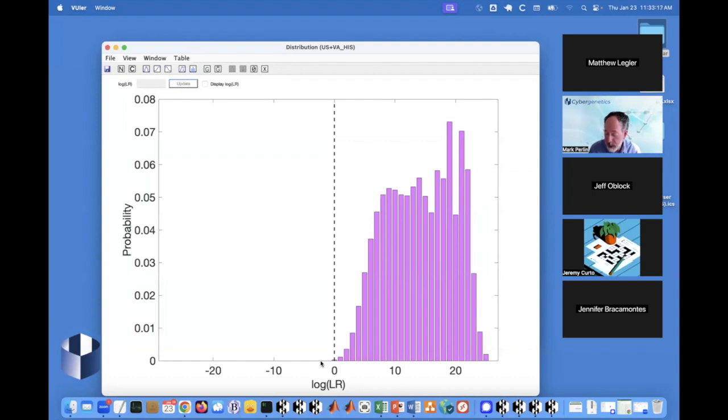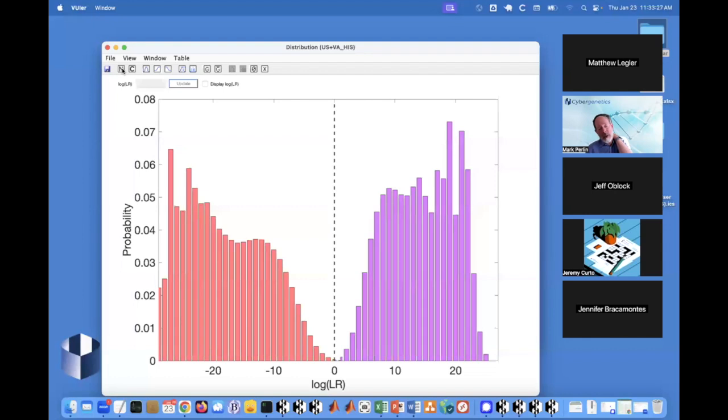And so we see this duality where anything you can do for inclusionary results, turn on the left curve, you can also do for exclusionary results by using the contributor distribution on the right. And we use this all the time. We don't know where the cases are coming from or what the questions are going to be. And we want to be able to report match statistics and error rates for basically everything.